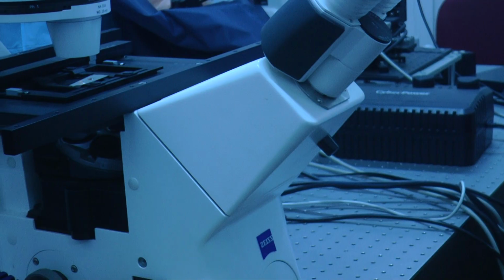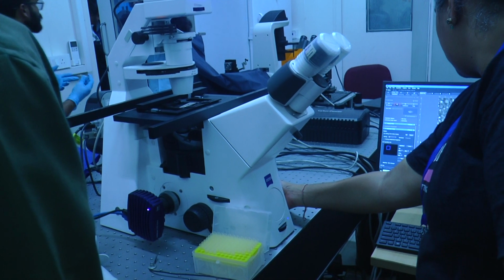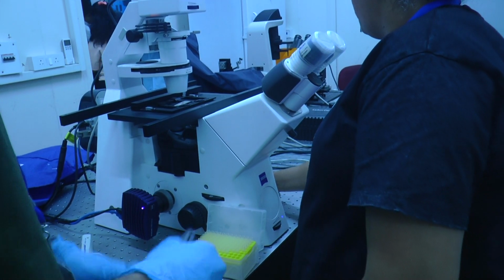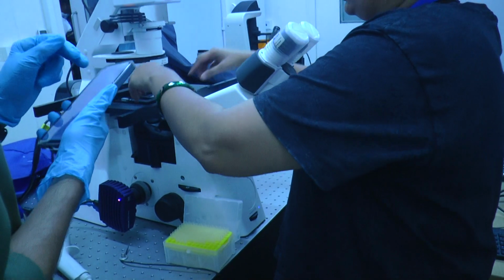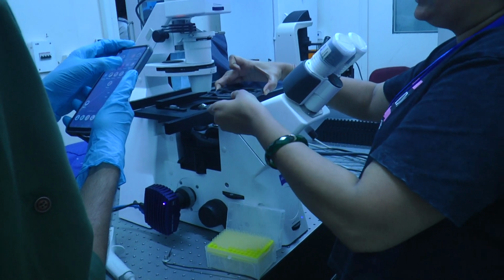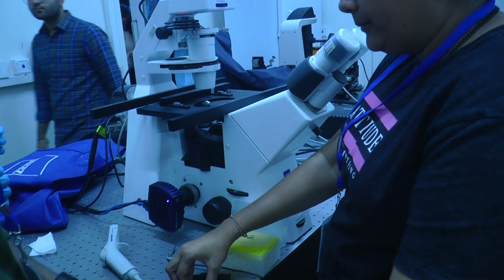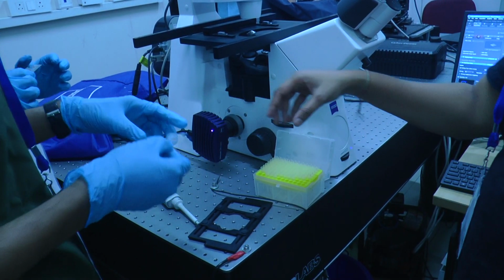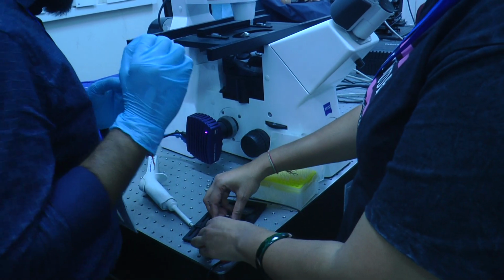So if we keep 0.6 for a very long incubation time, does it affect the shape? Of course it will, because it is used up gradually. Whatever salinity you put in, it is continuously being maintained. And how long will it maintain? Till the previous buffer and everything is maintained, and osmolarity is maintained. It gradually ends, because the red blood cell is continuously using it. What is your salinity? 1.2.